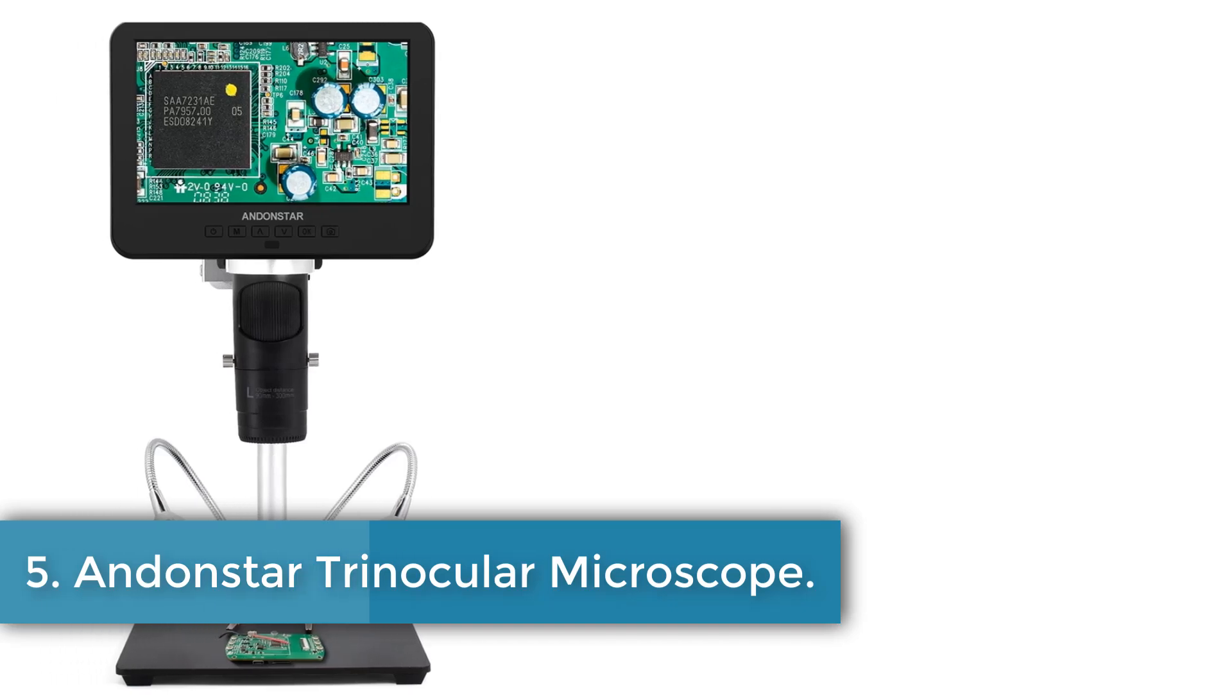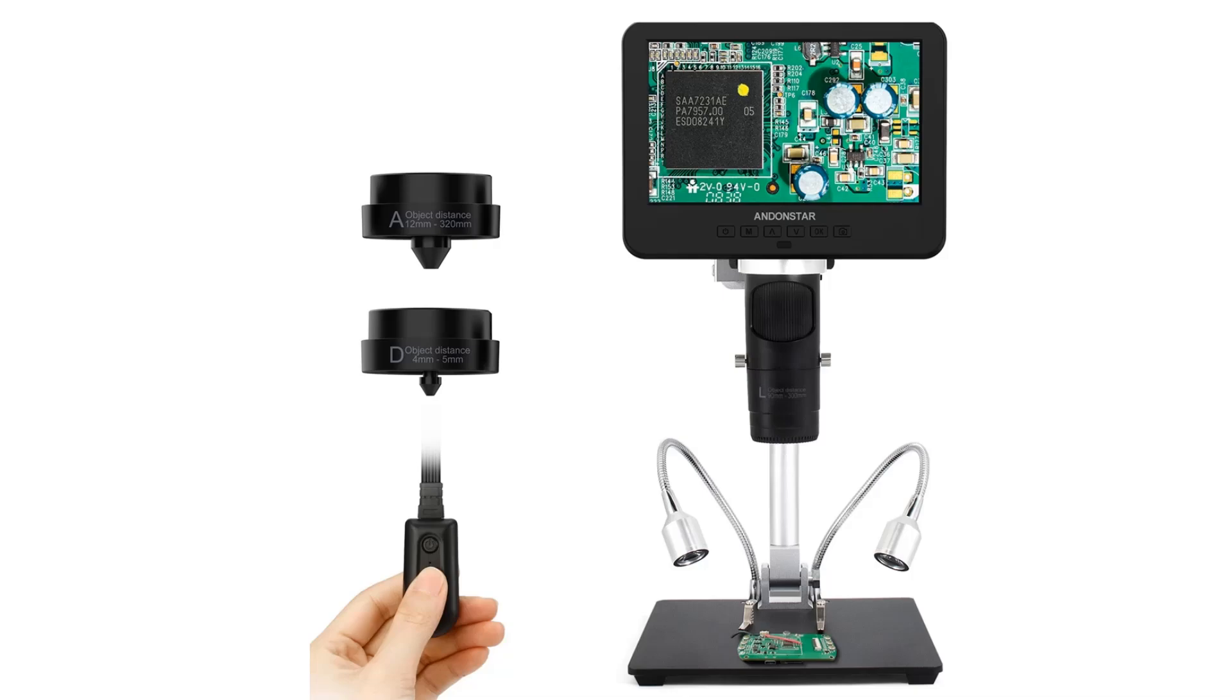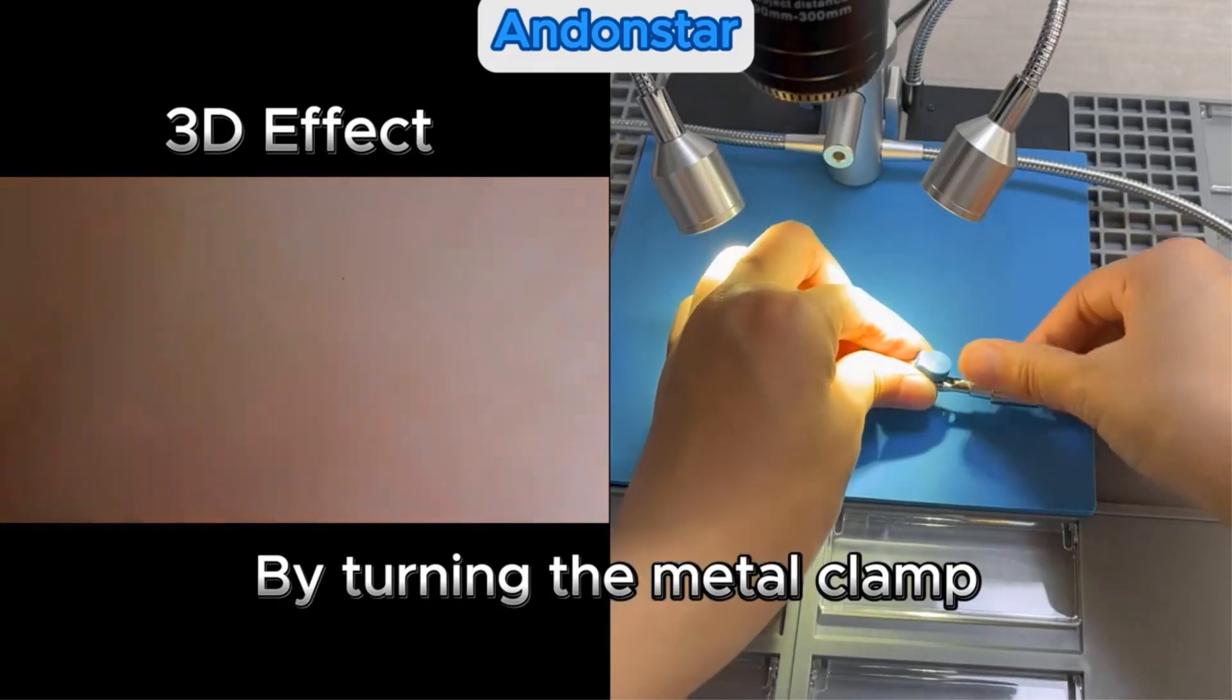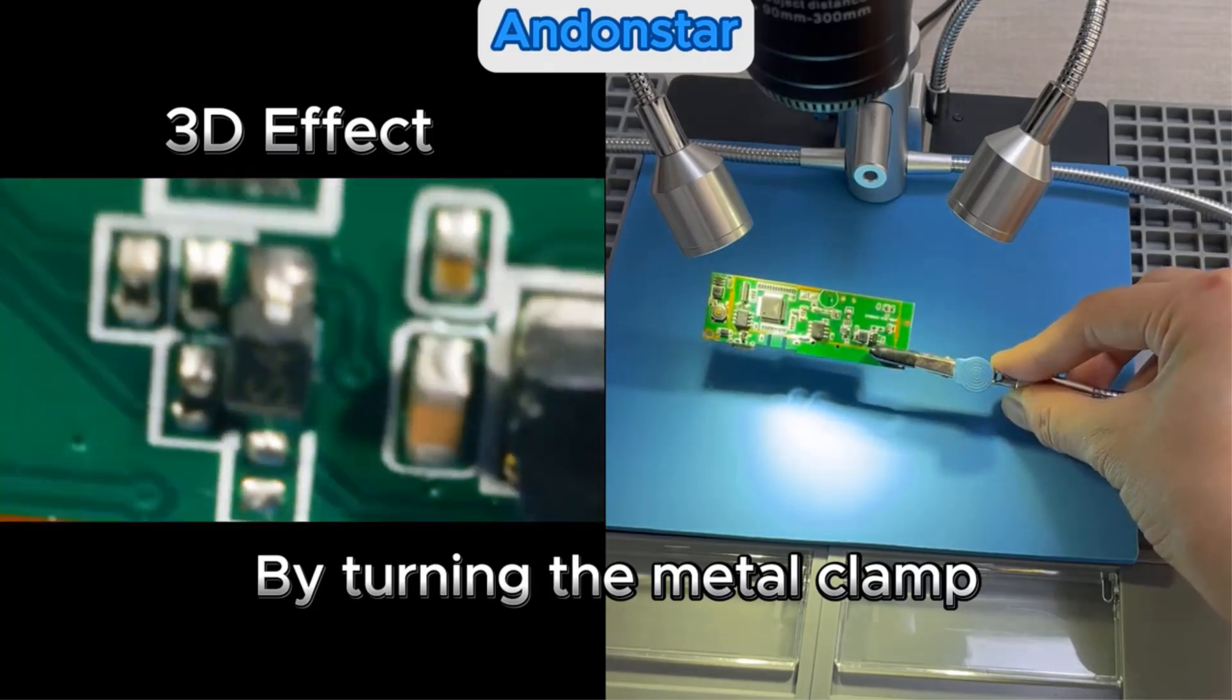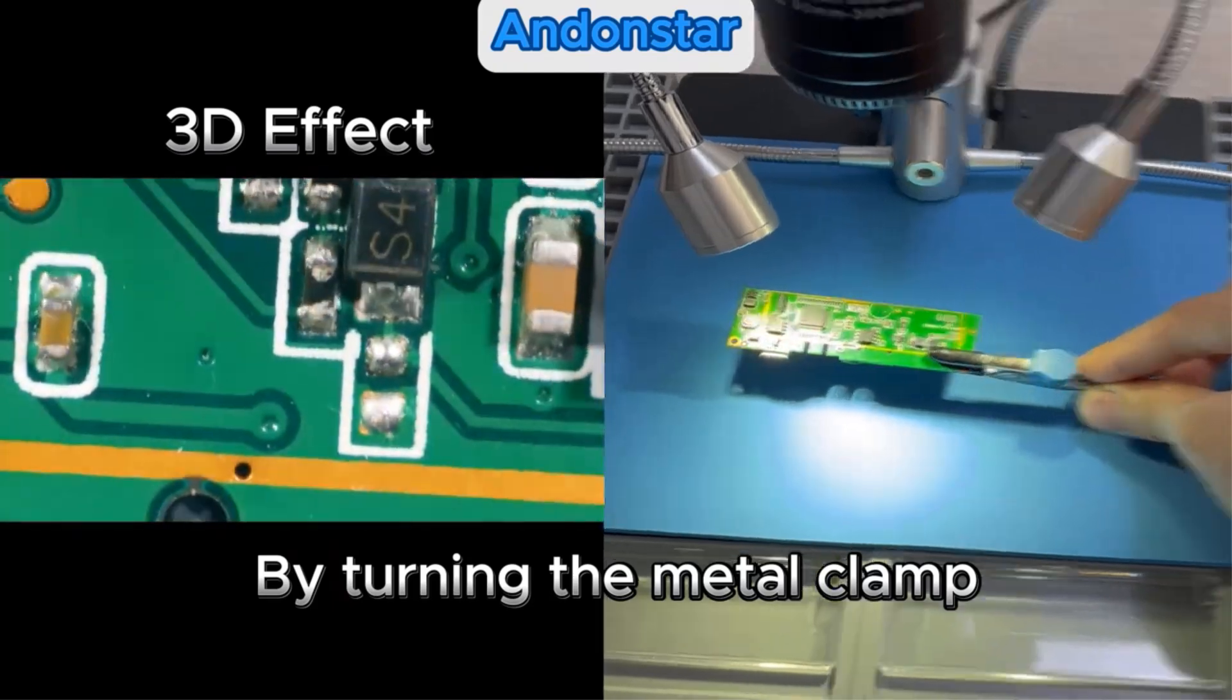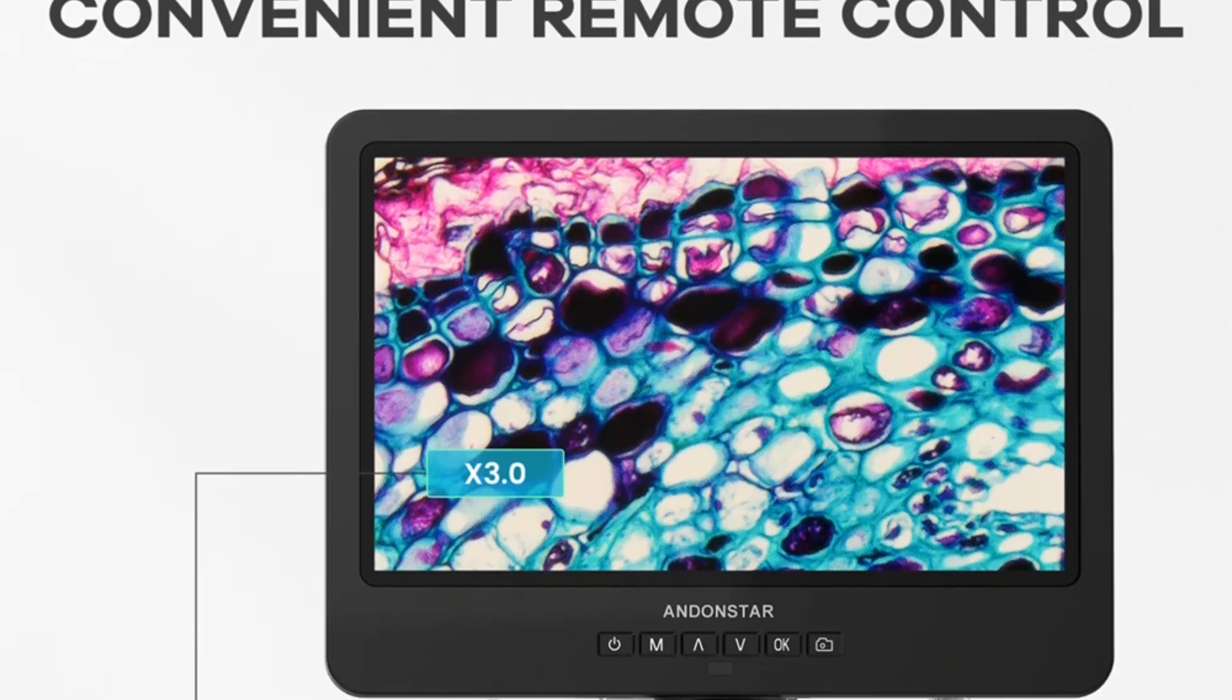Number 5: Andonstar Trinocular Microscope. The Andonstar AD249SM Plus is a high-definition video microscope designed for various applications, featuring a trinocular drawtube and a magnification ratio ranging from 1500x to 3000x, depending on the lens used. Built from durable metal and certified by CE, FCC, and ROHS, this portable microscope is ideal for both professional and personal use.